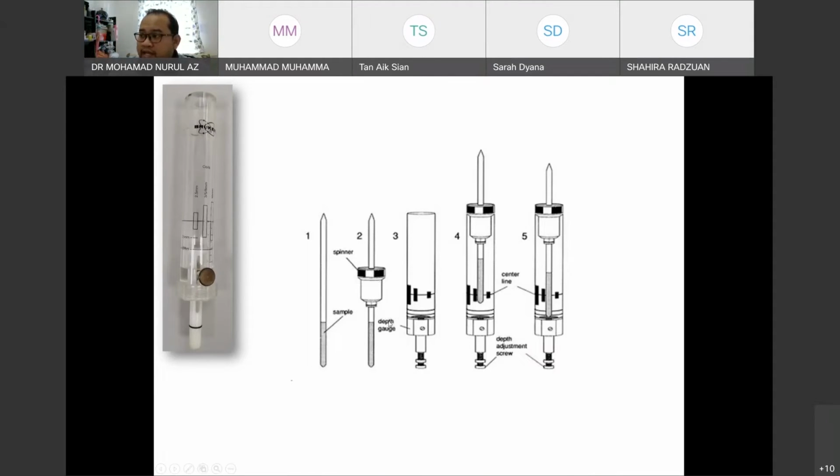You have to adjust the depth gauge. In our case, don't do that because we already did it for you, as this is the normal gauge level for the 5 mm NMR. If you use non-5 mm NMR tubes, please let us know and we will adjust it for you.